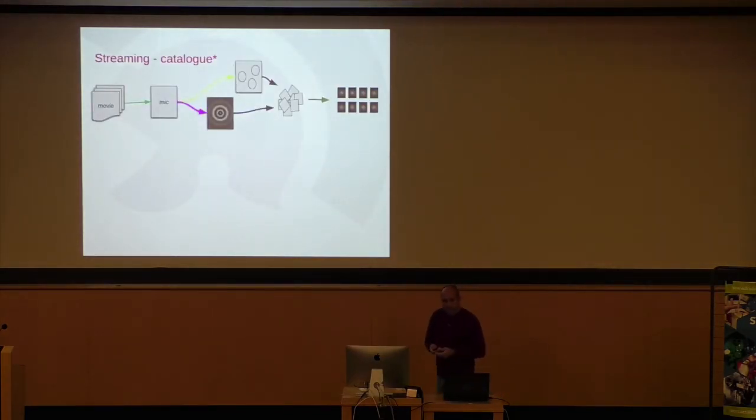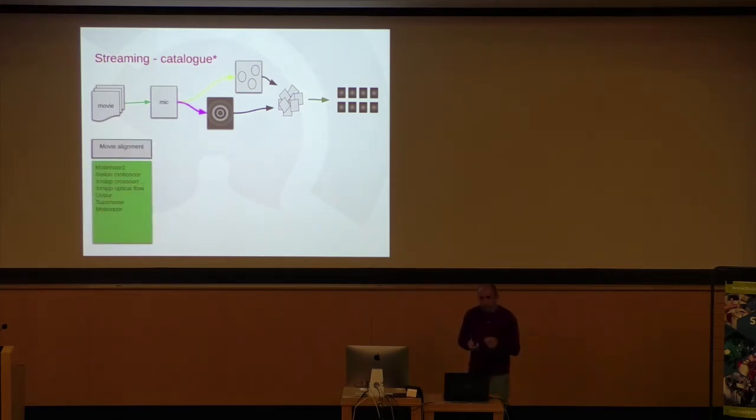So what can you find within Scipion? These few slides are about the streaming protocols. So those that are able to, as soon as they discover some input, output their result. There are many others that don't do this, and they are not listed here. So for those, I think we can reach 2D classification.